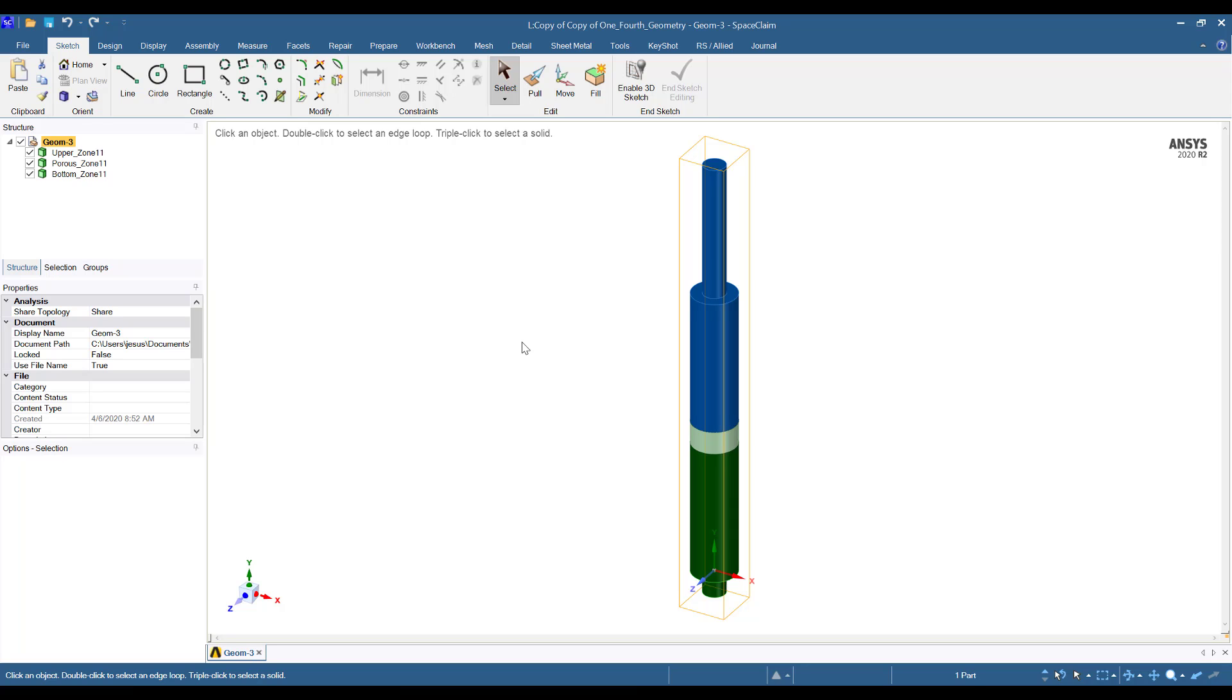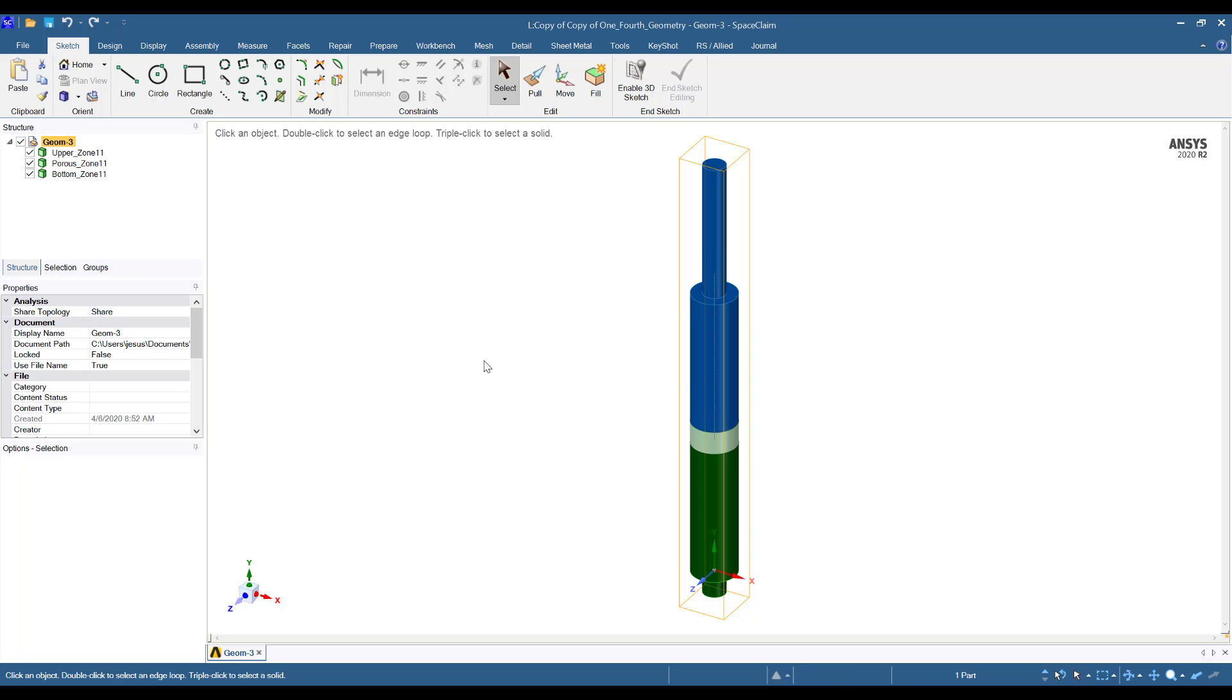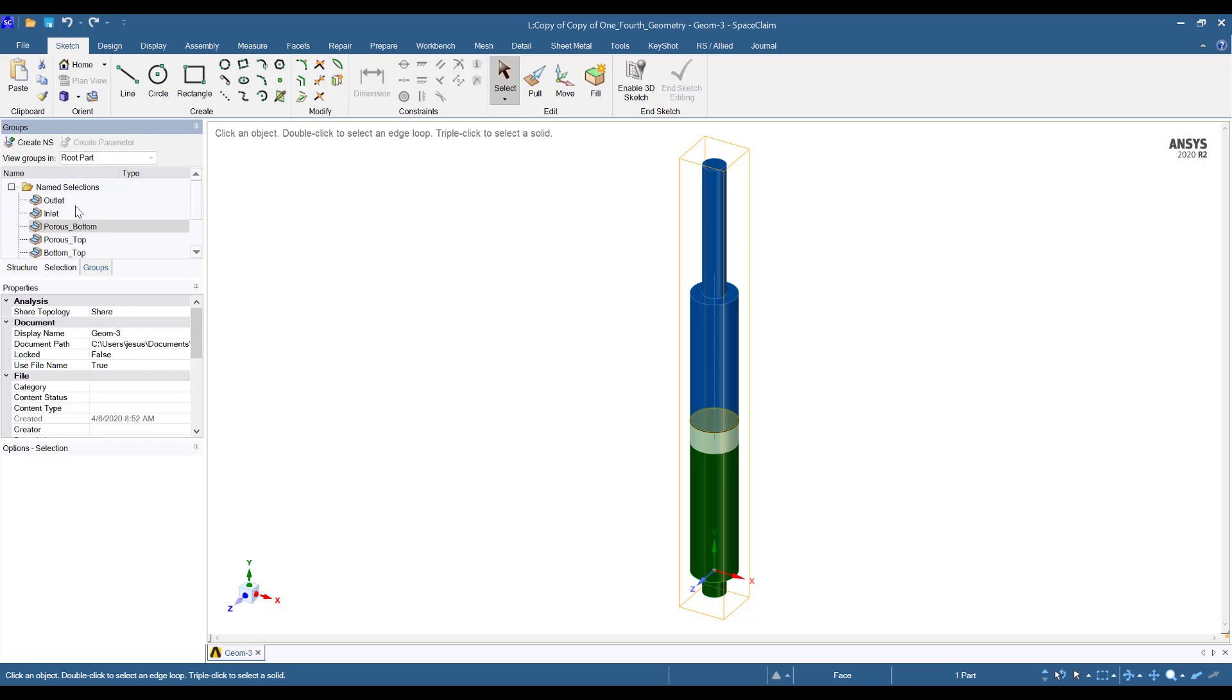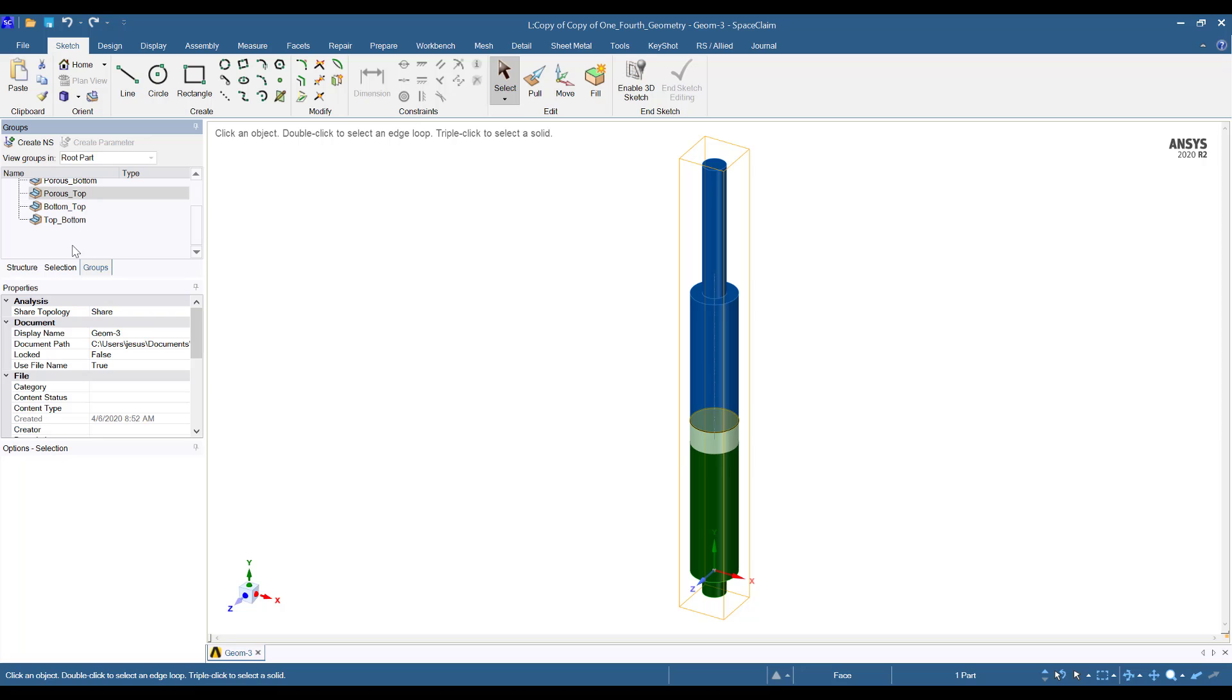Share topology implies that when the meshing process is performed, then you will have similar cells in the interfaces of these solids or of these zones. Also, you can see here in groups that I have different name selections or boundary names in order to facilitate the mesh generation and also for imposing the boundary conditions inside ANSYS Fluent.